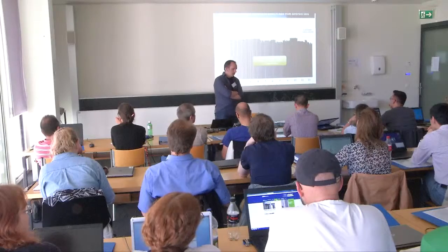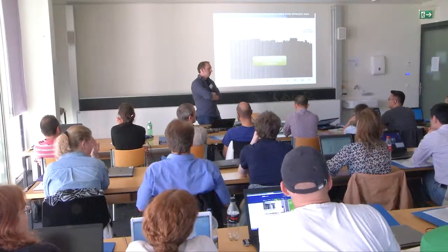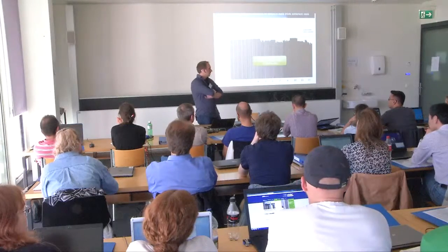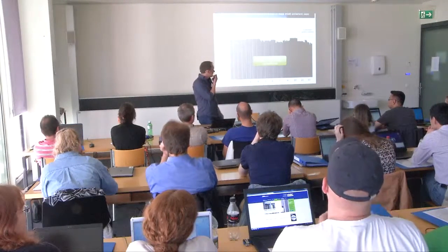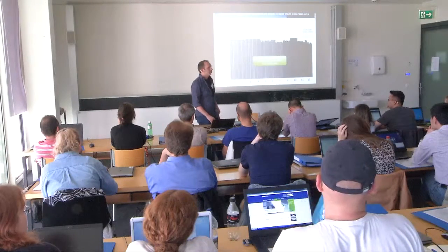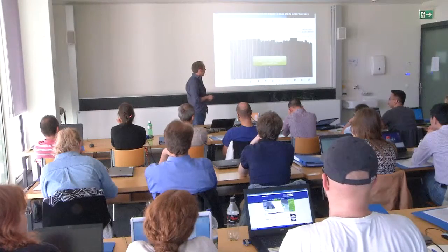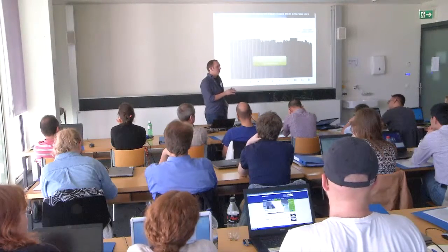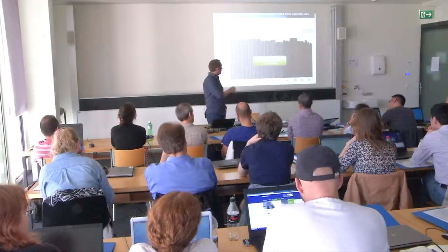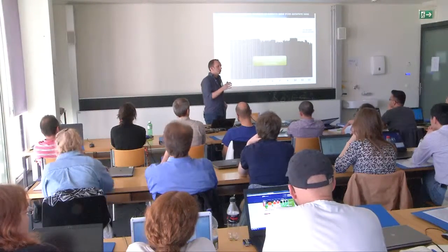Very good question. There are a couple of core facilities involved in this study, not all, maybe 2 core facilities. It's true that most of them are research mass spectrometry labs. Something I didn't mention about this study is that we had a QC round. Before we did this measurement, we sent around a representative sample to everybody and said, just shoot it a couple of times and see how it goes. And there the data looked a bit more heterogeneous.